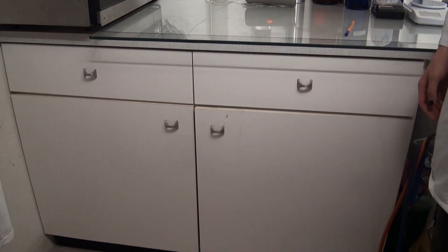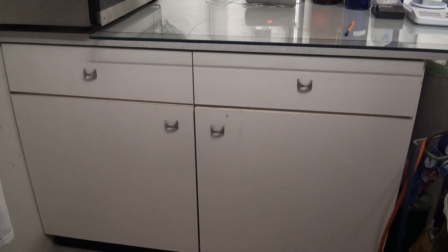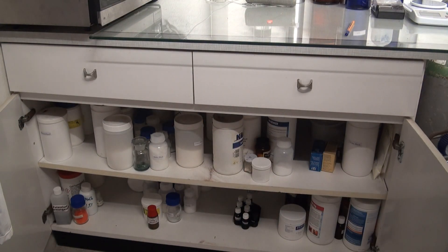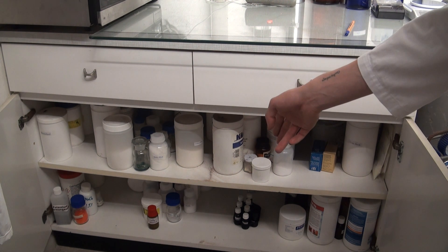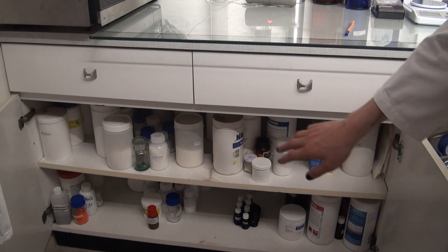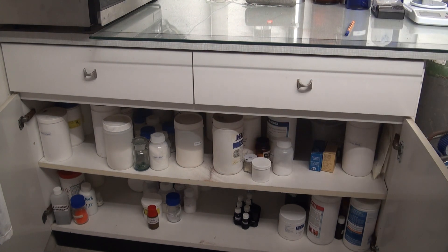And now, here is the moment you've all been waiting for — here is the majority of all my solid chemicals. That's quite a lot. This entire cabinet is already overflowing. I have a lot of sulfates, nitrates, hydroxides, carbonates, also oxides, organic reagents, miscellaneous stuff, organic acids, organic acid salts, esters, nitrogen compounds. I'll need to sort through all of them when I finally get all of this out, to replace it with a new one.